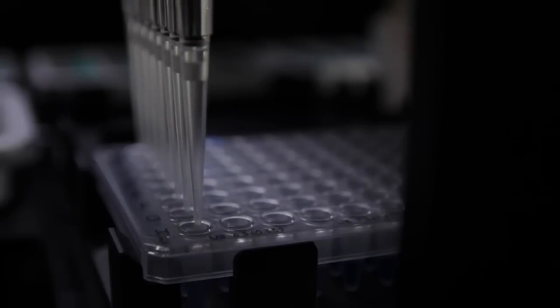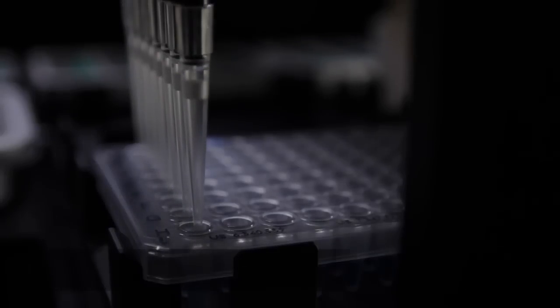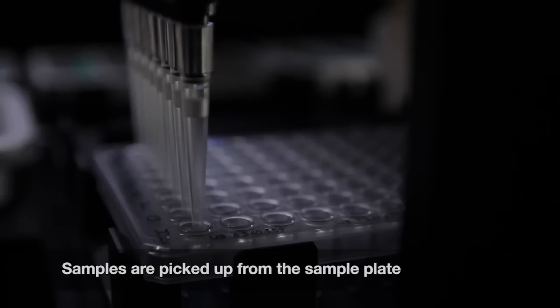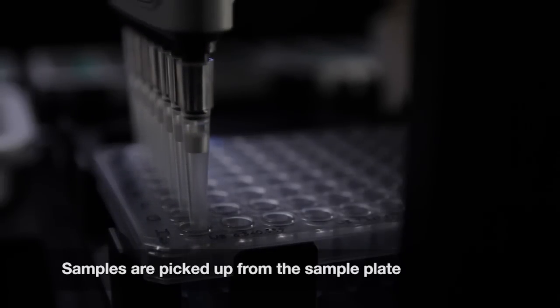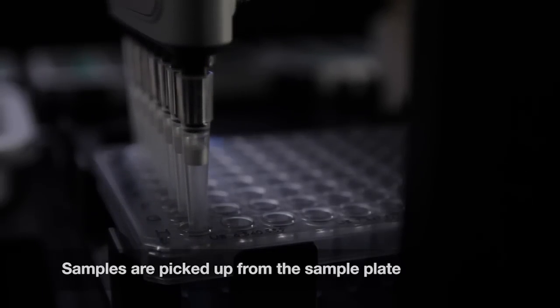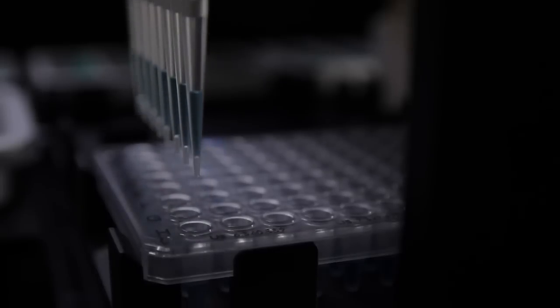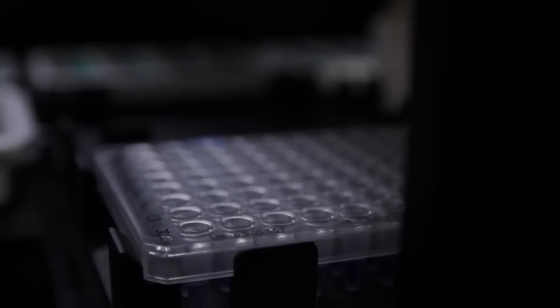First, the multi-channel pipetter transfers PCR reaction mix from each sample plate well to the sample wells of the droplet generation cartridge.